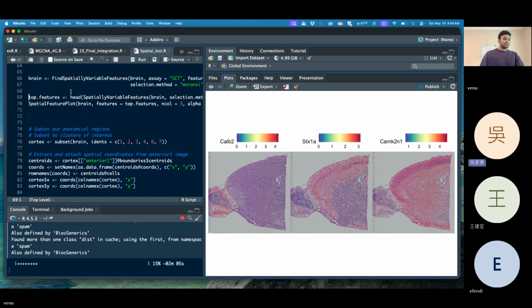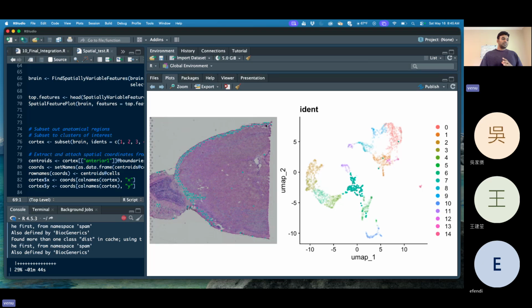Yes. When you talk about the cluster, does this cluster refer to a spatially close region? Yes, a region, spatially associated. All this region has similar expression. This is a little tricky. Even I initially did not understand this part. If each spot has similar expression, it must have similar cell types. But later what I understood is that we observed many markers, so there are layers of markers. That is the reason each spot has a proportion.